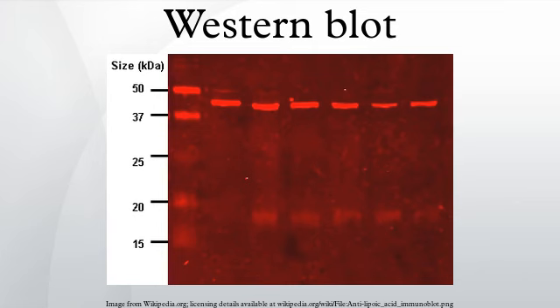Both varieties of membrane are chosen for their non-specific protein binding properties. Protein binding is based upon hydrophobic interactions, as well as charged interactions between the membrane and protein. Nitrocellulose membranes are cheaper than PVDF, but are far more fragile and do not stand up well to repeated probings.